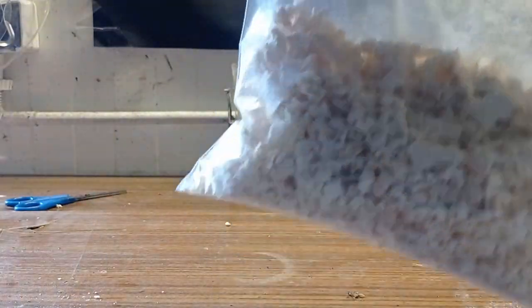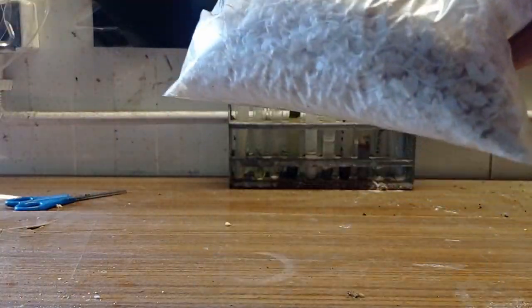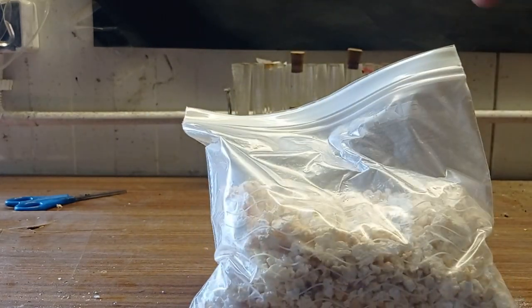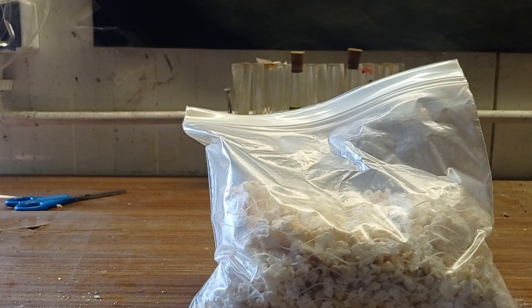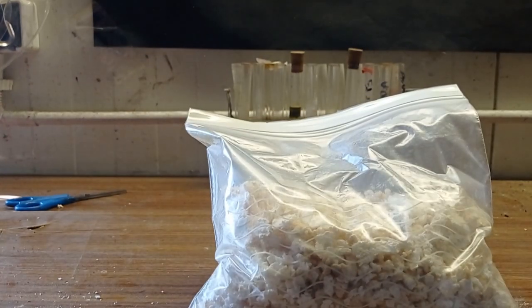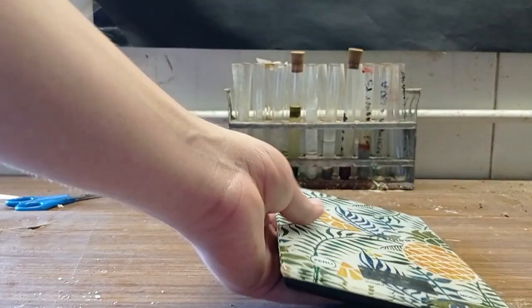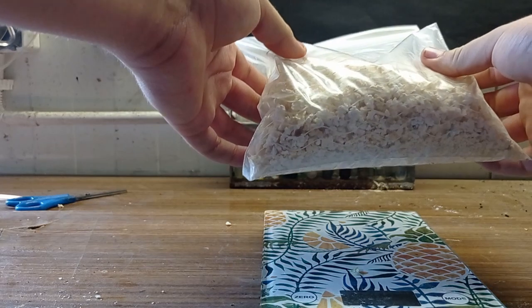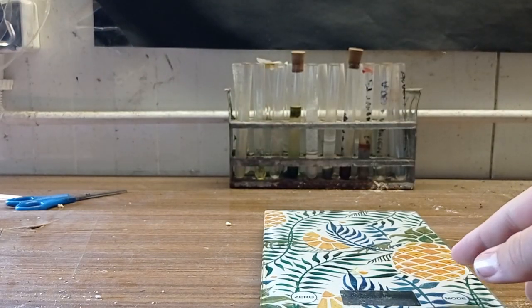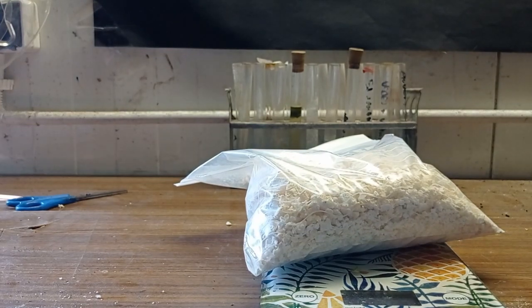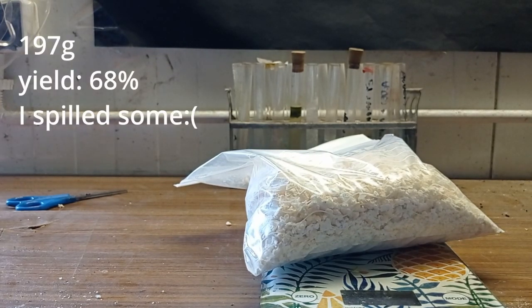Okay, so here's my bag of calcium acetate. As I said, that's still yellowish but it doesn't matter. And now I'll weigh it. 197 grams.